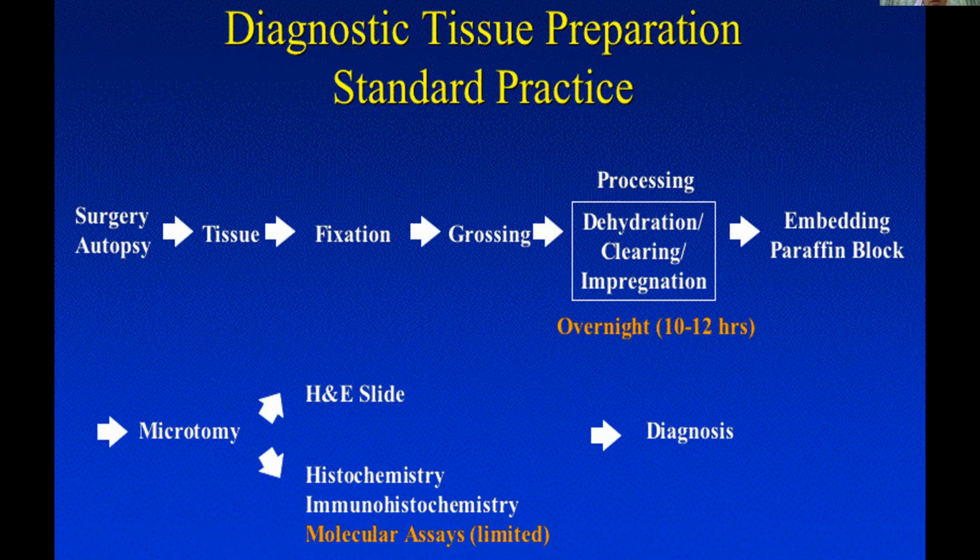Okay, for the big specimen, normally it takes 1 day to fix. Meaning when we get your specimen, we need to fix for 1 day. So this is day one story. Day one we need to fix the specimen first, and then the second day what we do is grossing. Grossing meaning we need to do the gross examinations and selections of the interest areas. That's the grossing definition in the second day.